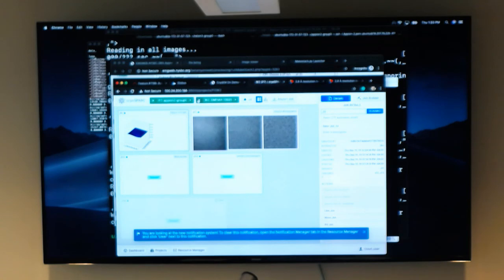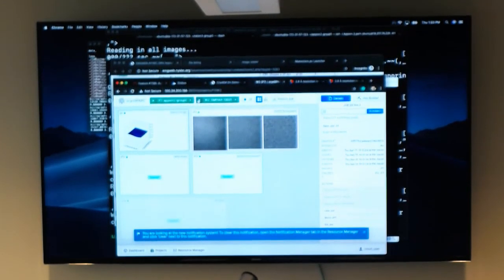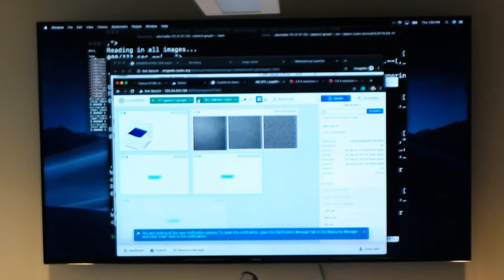So here should be the map, and this is the map, this one. I don't want more download. Oh yeah, this you can see, we can open the sky map. Okay.